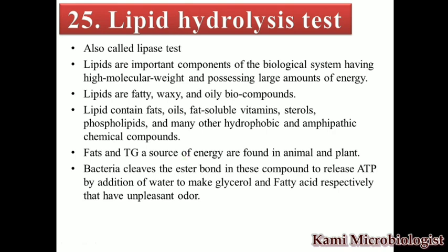When the bond is broken down by the addition of a water molecule, energy is released, that is ATP, and the byproducts are glycerol and fatty acid. When glycerol and fatty acid are produced, we get an unpleasant odor. So this is how the lipid hydrolysis test works, and this is a little introduction to the lipase test.